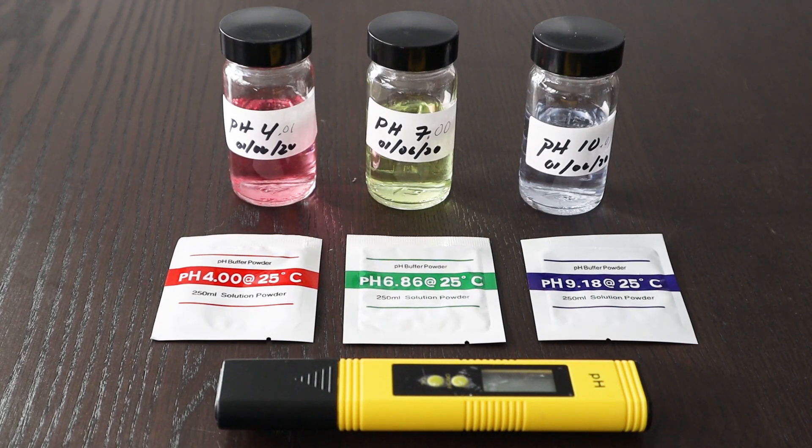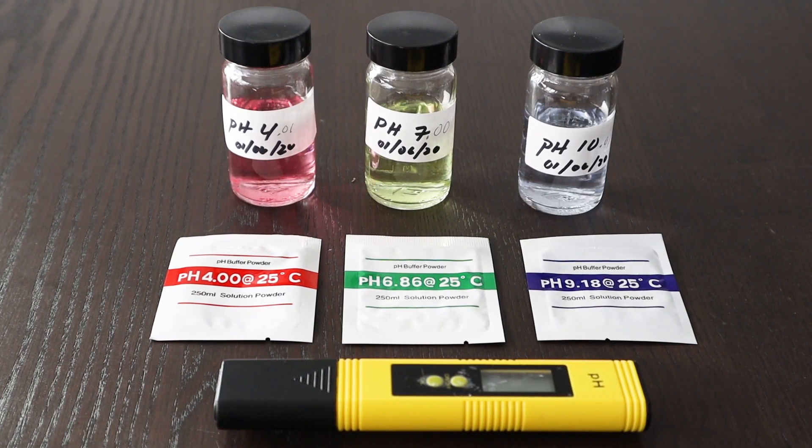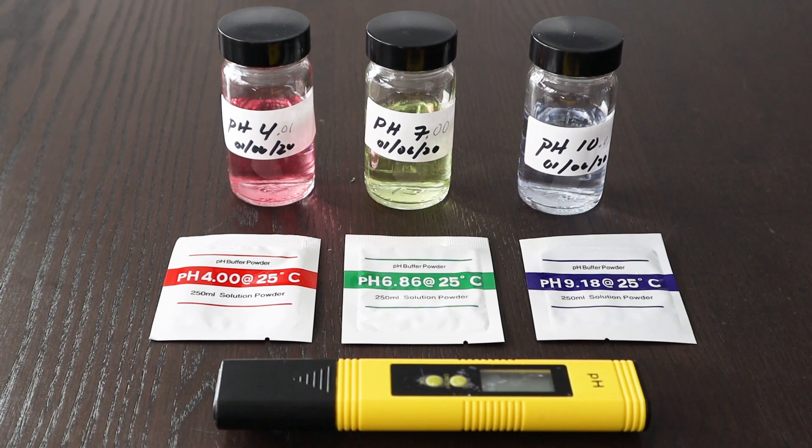Hi, welcome to Attainable Green. I'm Jess and today I'll be showing you how I calibrate my pH meter.